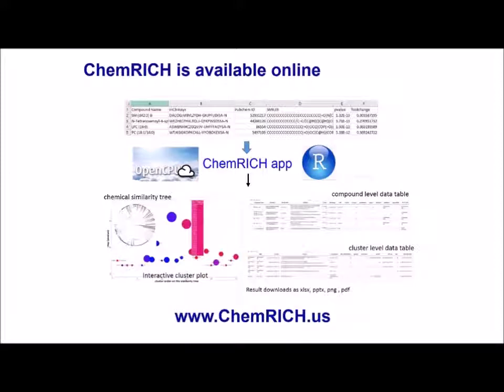ChemRICH is available online at www.chemrich.us. You will be redirected to another URL where the ChemRICH app is hosted. I wrote the ChemRICH app in the OpenCPU framework for R. The input file has this structure: the first column should be compound names, the second column should be InChIKeys, the third column should be PubChem IDs, the fourth column should be SMILES code, and then we have p-value and fold changes.